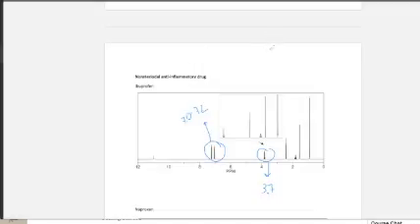So in terms of looking at all our ppms, what this leaves us with is the structure of ibuprofen, which is the one I will draw right now. So it's going to be the first methyl group right here. It's going to be another methyl group right here. It's going to be a CH2 right here. It's going to be the aromatic ring that is present in our compound. And then it is going to be another methyl group with the alcohol right here.